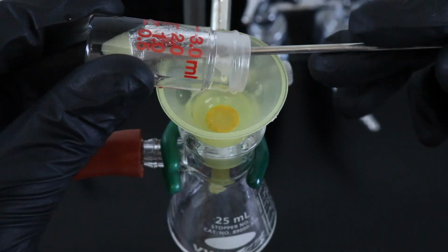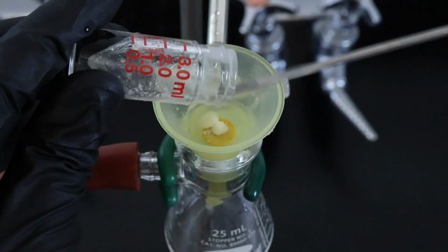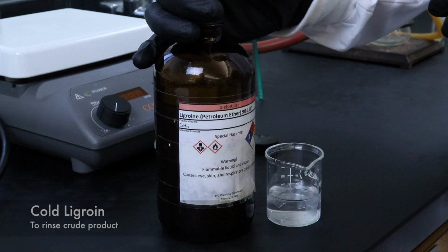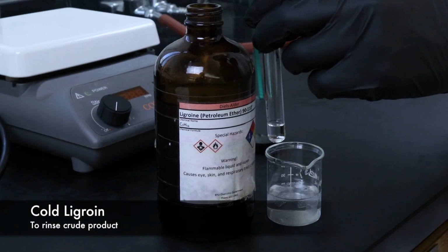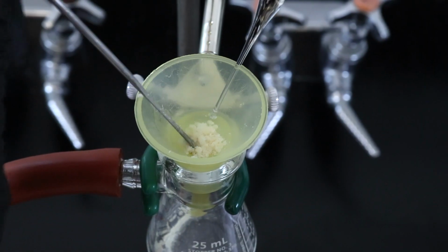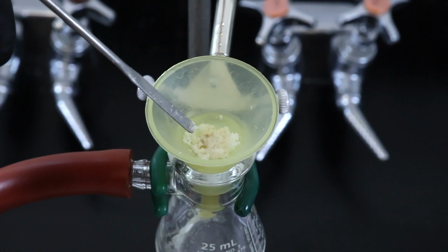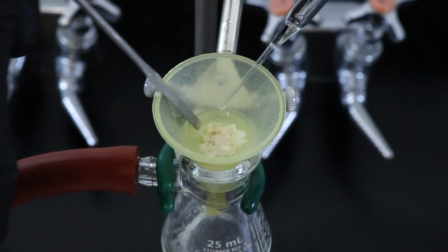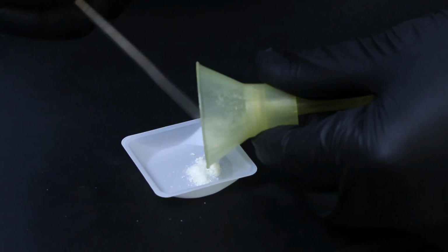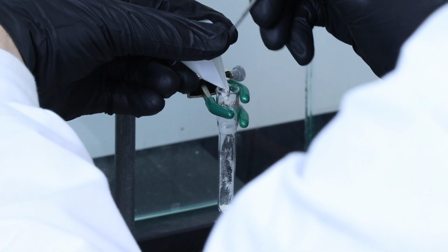Then the crystals can be isolated using a Hirsch funnel and vacuum filtration. Then I'll be using some cold ligroin to rinse the contents of the conical vial and also rinse the product on the Hirsch funnel, and I'll go ahead and rinse it a couple times. Once the crude product is dry, I'll remove it from the Hirsch funnel and then move it to a Craig tube where we can start the recrystallization process.